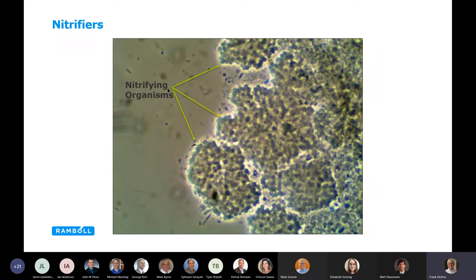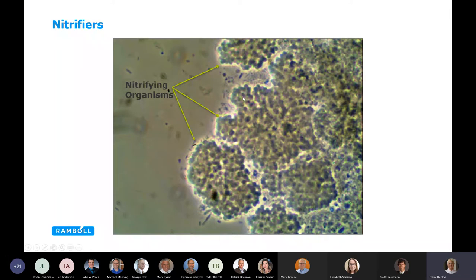We can also look for nitrifiers. If your system is required to nitrify as part of nutrient removal, you can spot nitrifiers in the biomass at high magnification — they appear like little bunches of grapes along the outside of the biomass. You have to look real close and know what you're looking for.